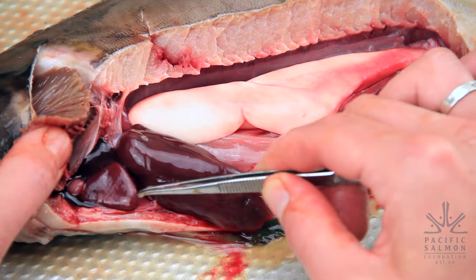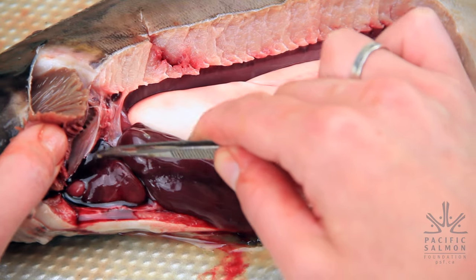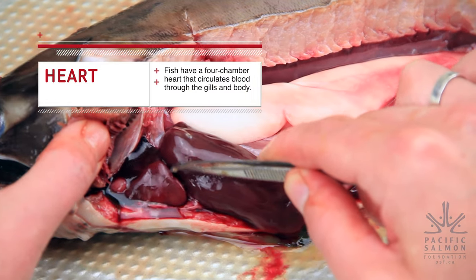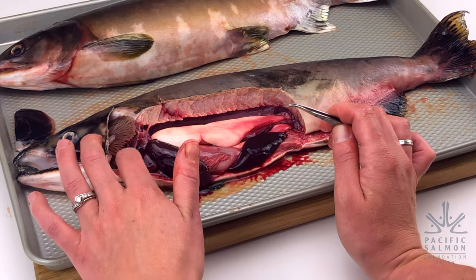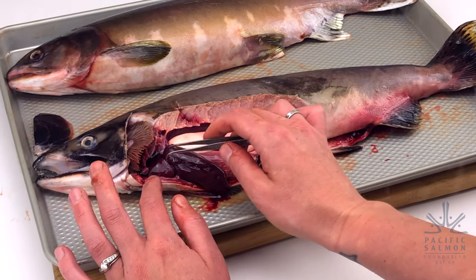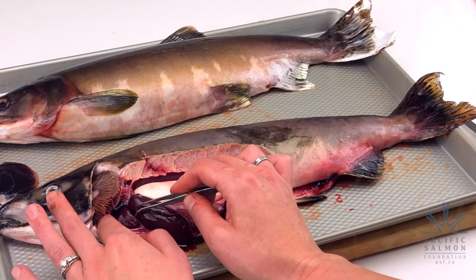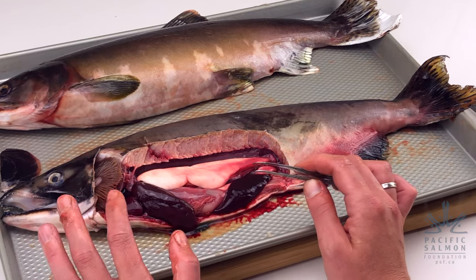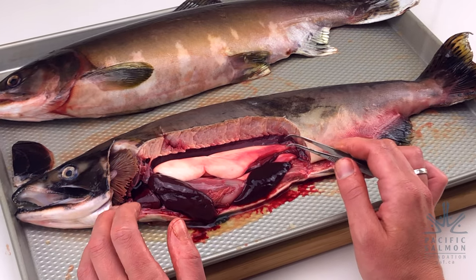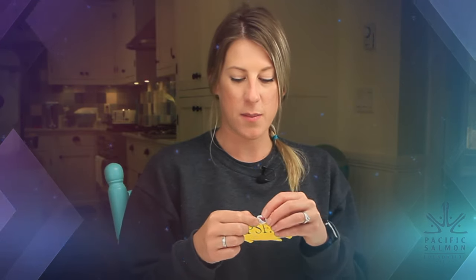Next, we'll look up here at this little organ — can you think of what it might be? This is the heart. A fish's heart is similar to yours in that it helps pump blood towards the gills and around the fish's body. A fish has a four-chambered heart, and some studies have shown that fish that migrate farther upstream have stronger, bigger hearts than fish that don't have as far to migrate. Find the heart on your diagram, cut it out, and put it in the correct position.